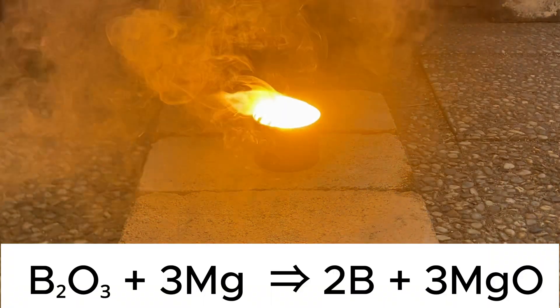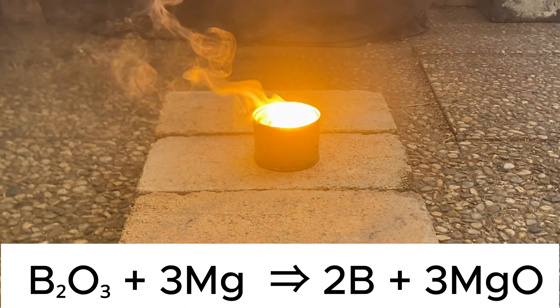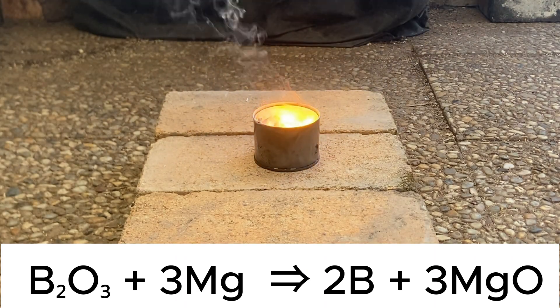The boron oxide reacts with magnesium metal to form boron and magnesium oxide.